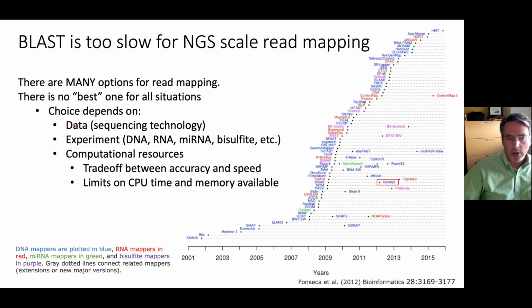In general, your choice of aligner is partly based on the sequencing technology. We have Illumina sequence. Bowtie 2 is designed to handle Illumina sequence. So it knows the quality scoring and all that kind of stuff. It knows the biases that are there. It knows how to deal with paired end sequencing, right?